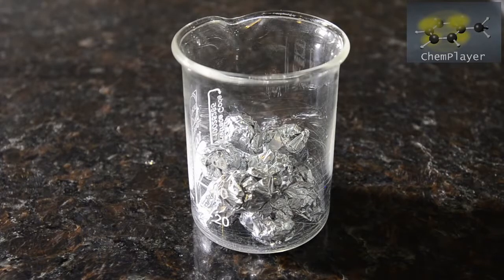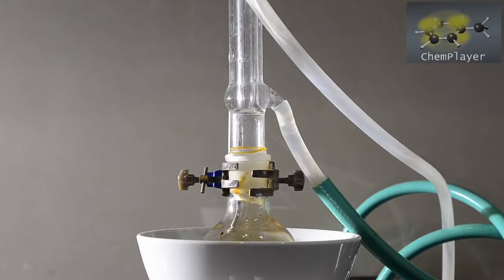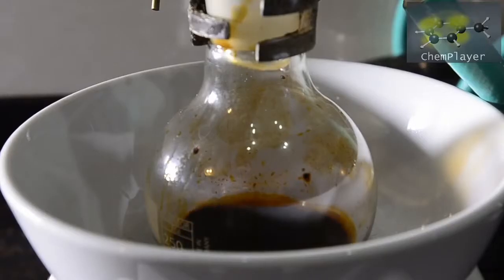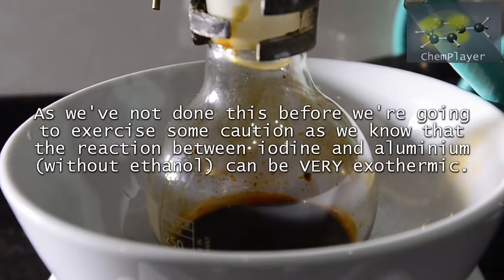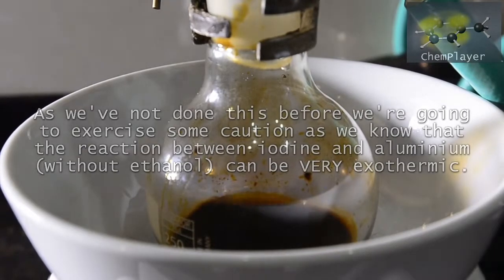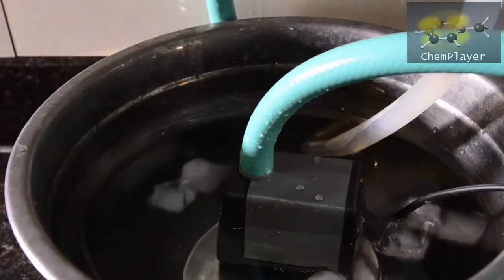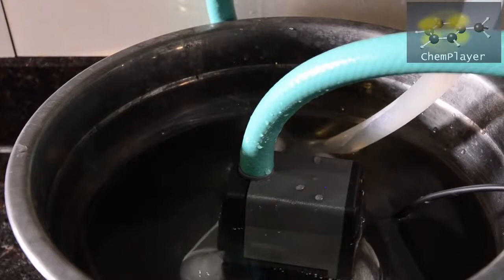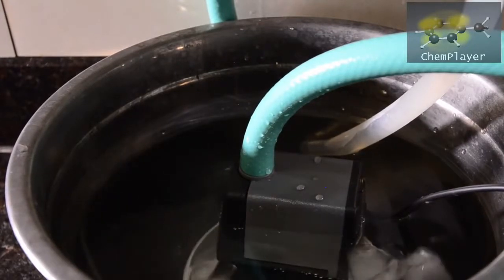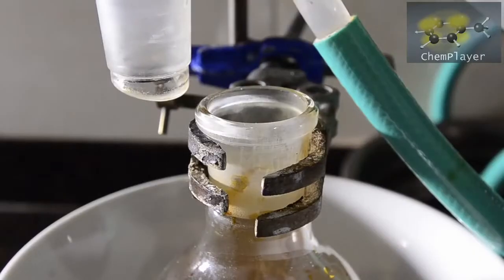Here's our setup: we've got a flask on a stirrer equipped with a Liebig condenser for refluxing and sitting in a bowl just in case we need to apply rapid cooling water. We have no idea how quickly this reaction is going to go or how vigorous it's going to be, so we want to be on the safe side. We've got ice in the cooling water because ethyl iodide is quite volatile. Let's get started.